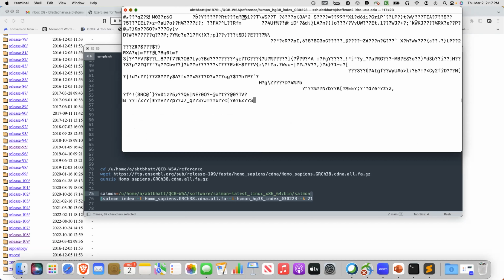And the JSON files are sort of tab delimited files that store these hashes that we need to run against, I guess.